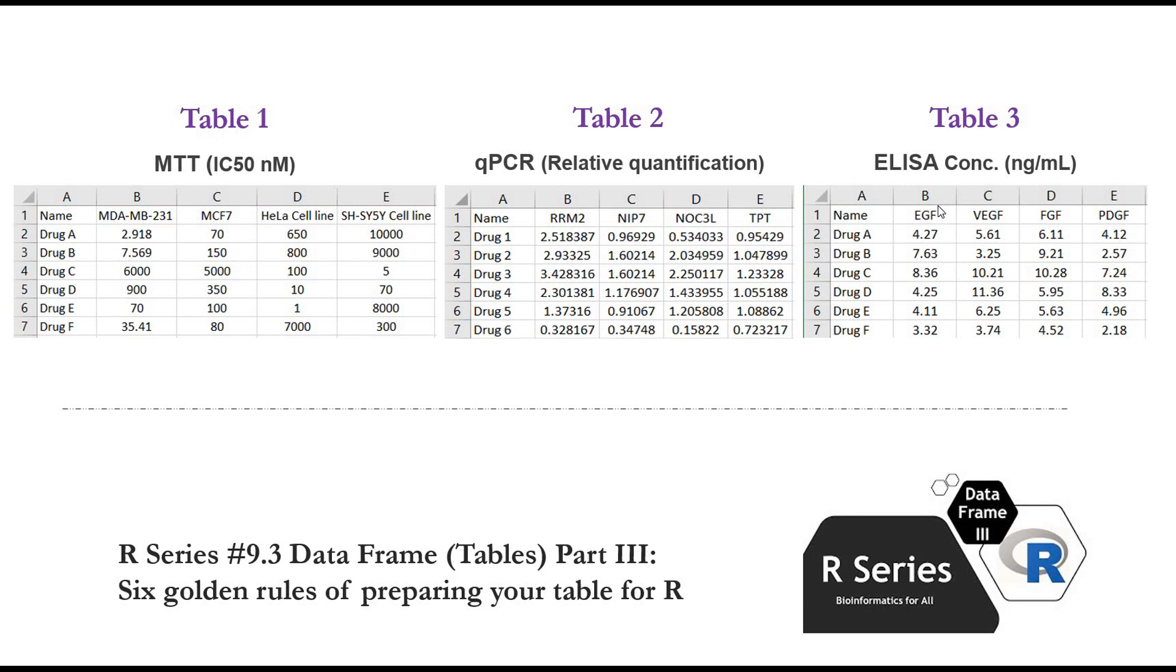And table 3 is ELISA kit assay and concentration are expressed in nanogram per milliliter. So let's go to RStudio and see how we can generate a heatmap from each table.